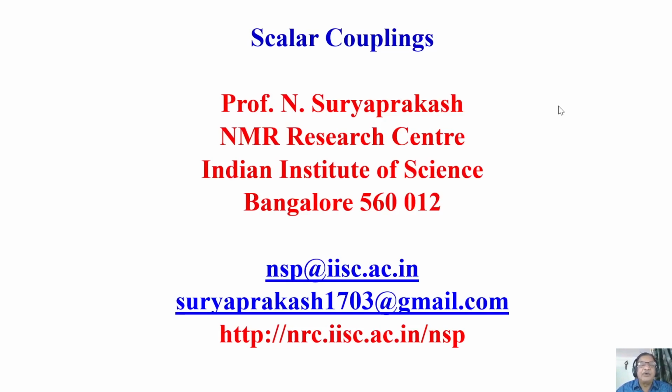And we understood a lot about chemical shifts, what happens to it with the magnetic field, the difference between the ppm and chemical shift scale, and the factors that influence chemical shifts. Everything we understood. I hope you are all with me.